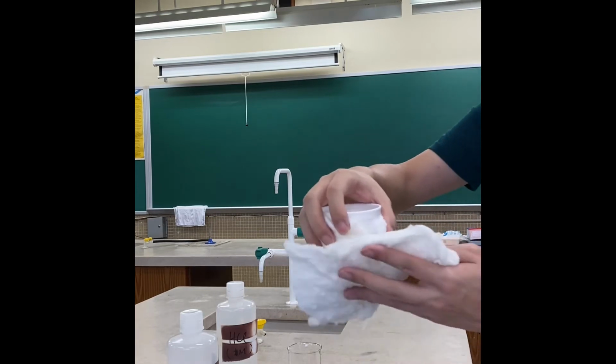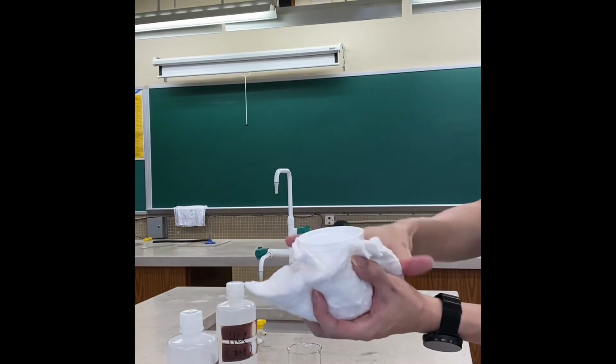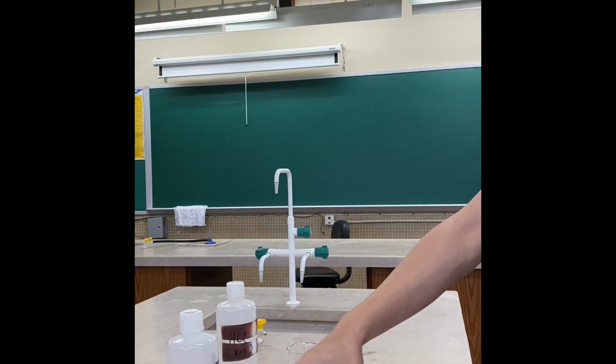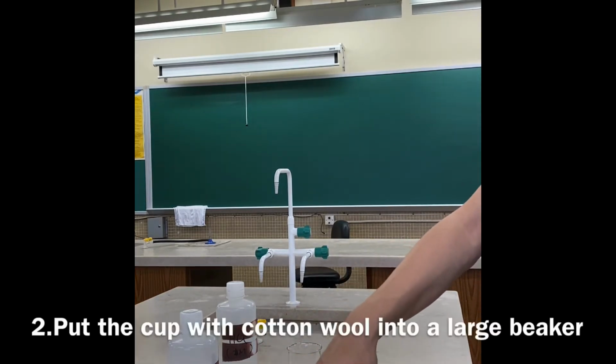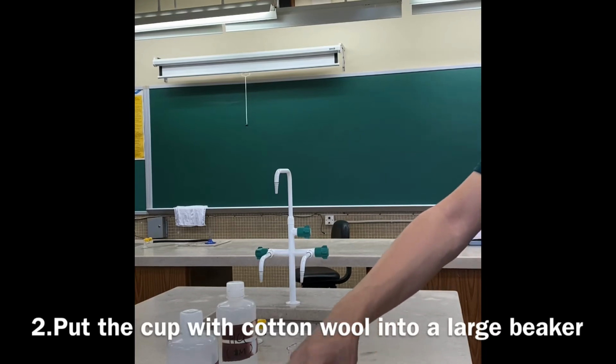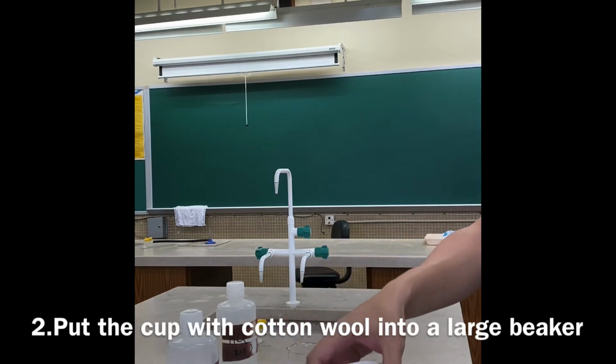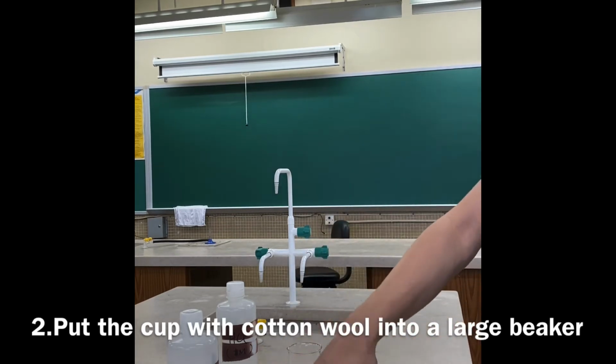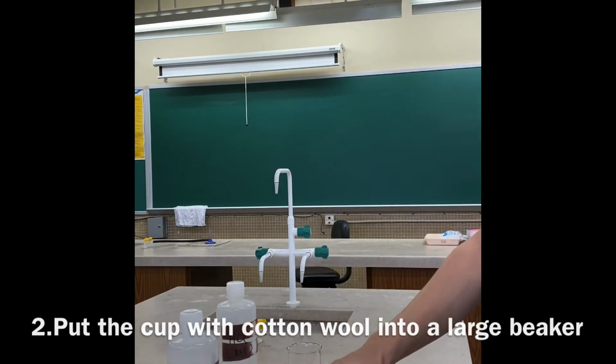Can you tell me the reason why we have to use cotton wool and this polystyrene cup? Yes, they are good insulators. They can trap air so that they are good insulators of heat. It seems that too much cotton is used. And then just put it inside.